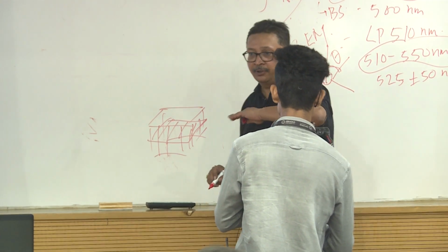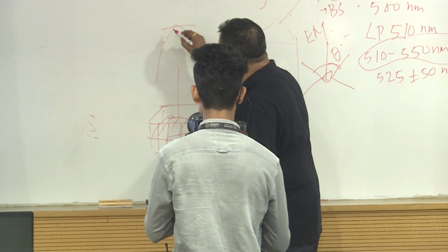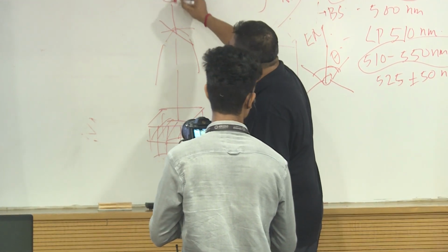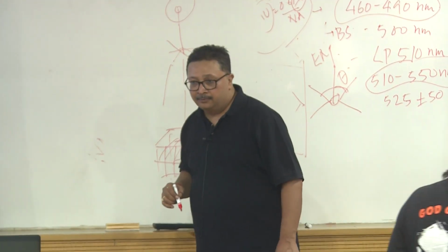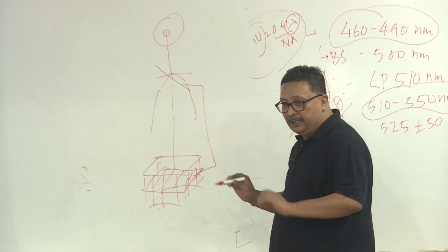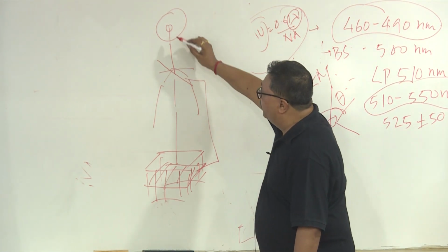Your in-focus, precise focal plane. So you have your objective, the dichroic, and then you have the pinhole in the conjugate focal plane. When you say conjugate focal plane, what does it mean? Same focal plane. As a layman, whatever is the distance of this dichroic from the exact focal plane, the same will be the distance of this dichroic from this pinhole opening.